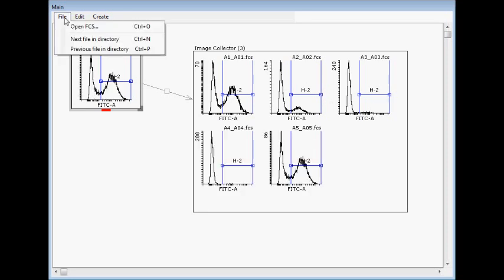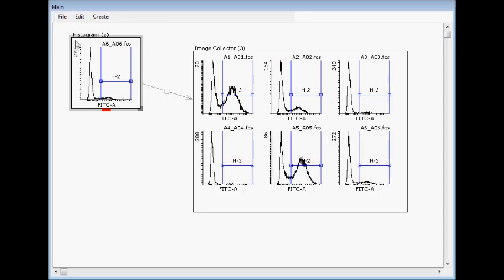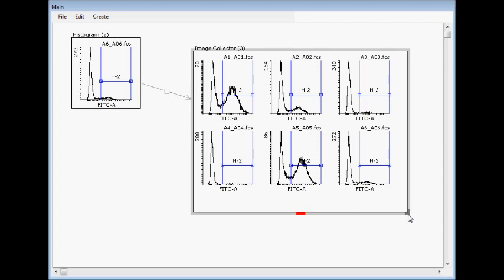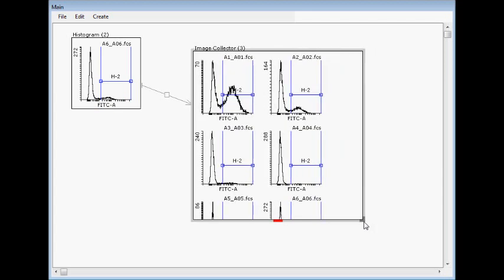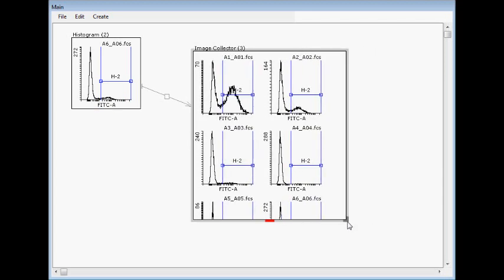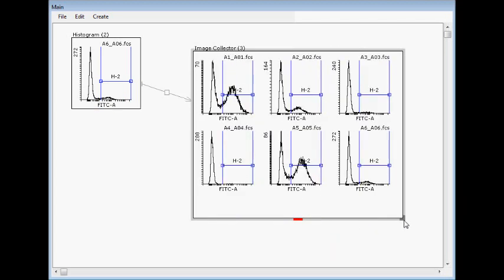Let's select a little bit more like this. And then if you resize it, then it will reorganize the images.